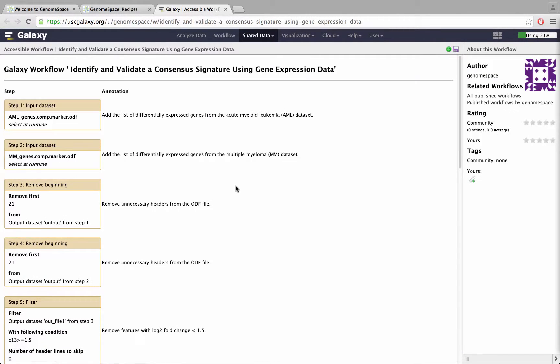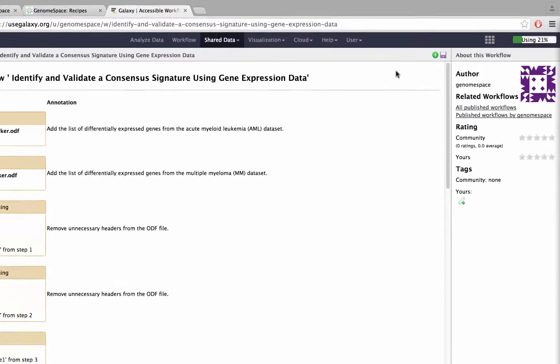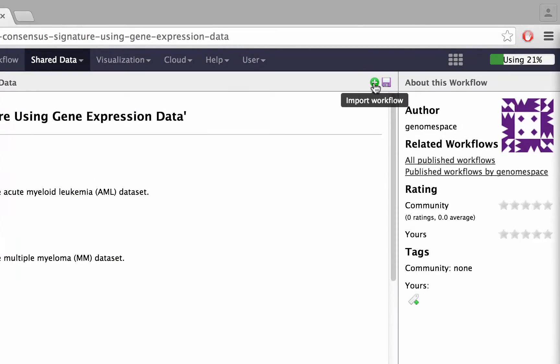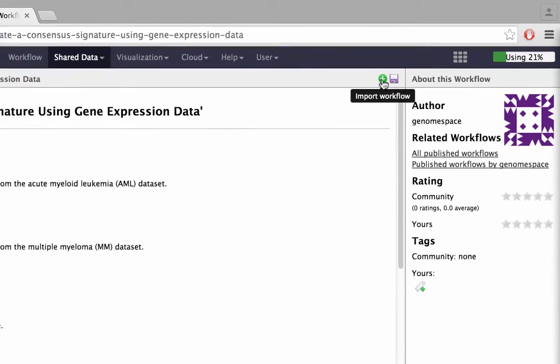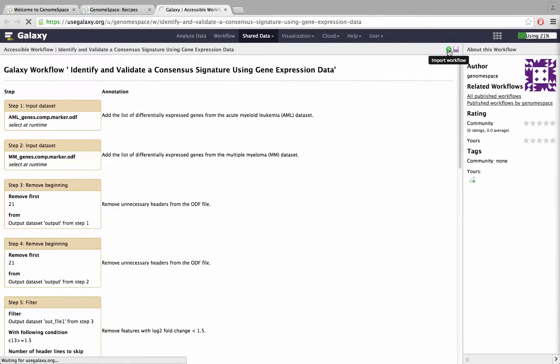A new browser tab should open with an overview of the particular workflow. In this case, identify and validate a consensus signature using gene expression data. Click the green and white plus icon to import the workflow into your personal Galaxy account.